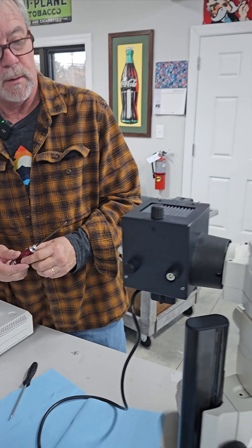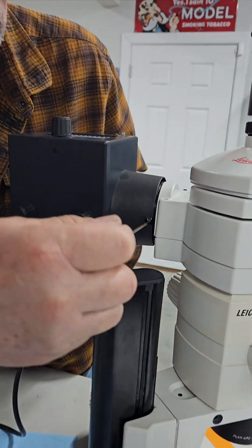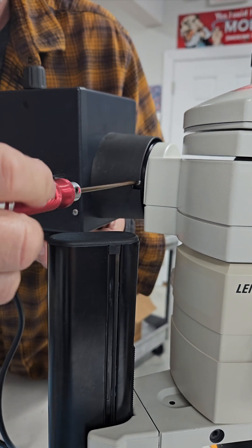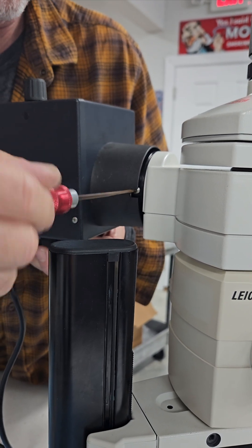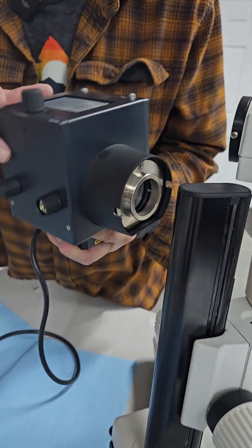Here's the mercury lamp house. There's a three millimeter Allen screw in here. Loosen that, remove the lamp house.